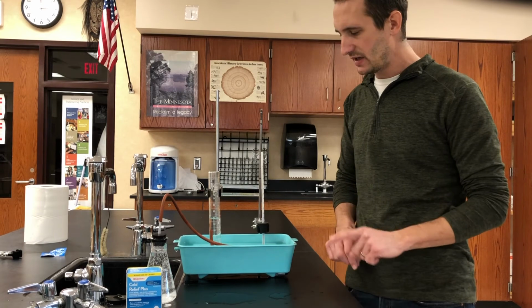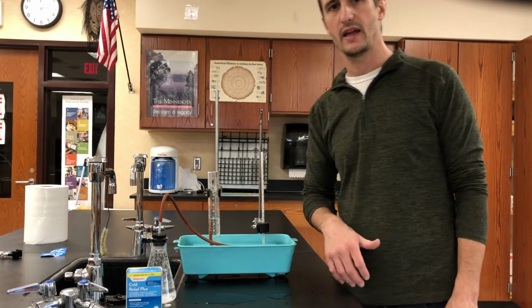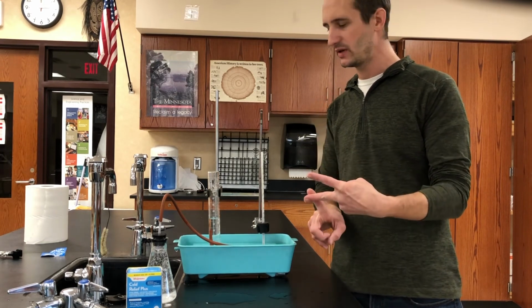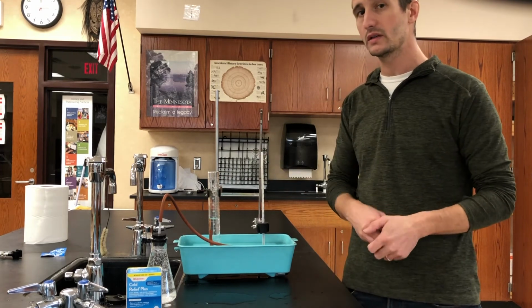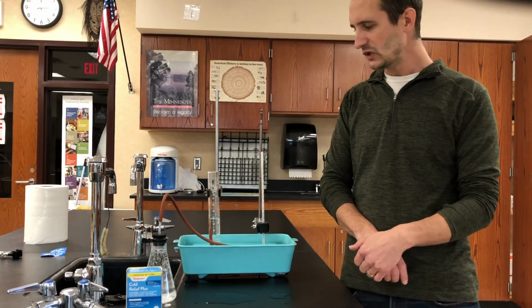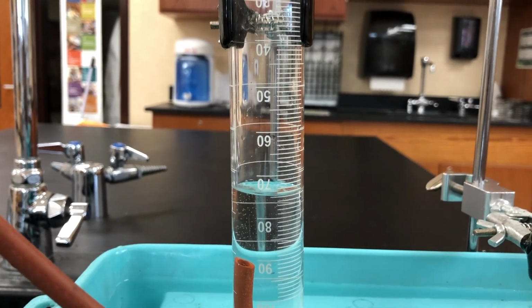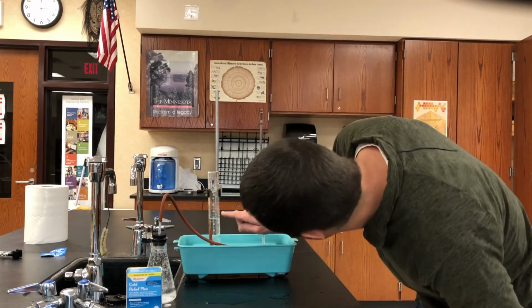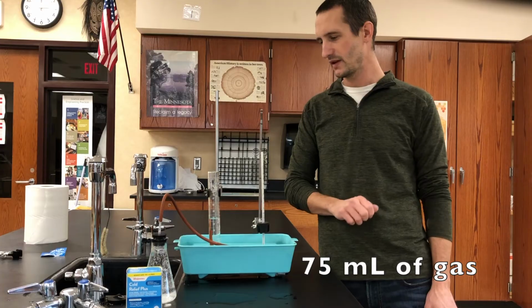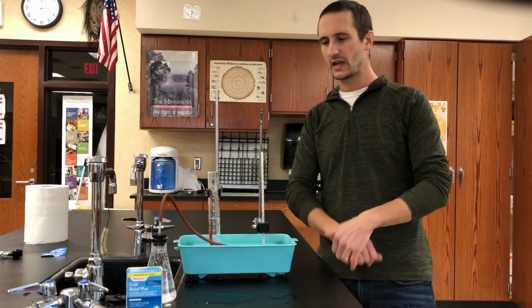And we also have to keep in mind that this gas that we've collected inside of the graduated cylinder is in fact a mixture of gases. It is carbon dioxide gas and it is water vapor. Since we're collecting the gas through water, water vapor is automatically present in the gas that we've collected. And so the volume of the gas that we've collected looks like, a little tricky to read this because it's upside down, it looks like 75 milliliters of gas. So with that data, we should be able to calculate the number of moles of carbon dioxide gas produced.